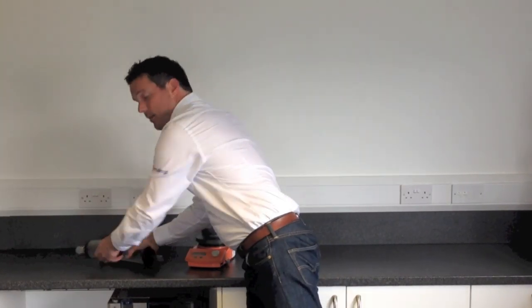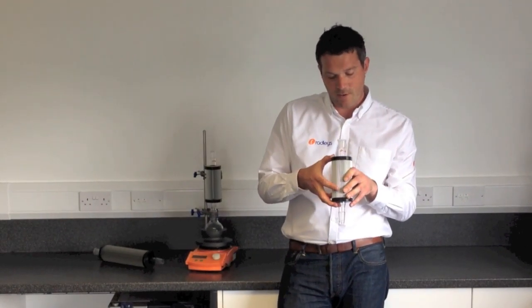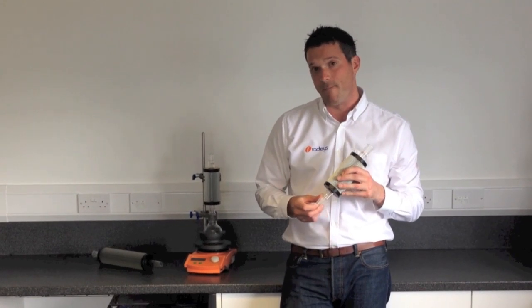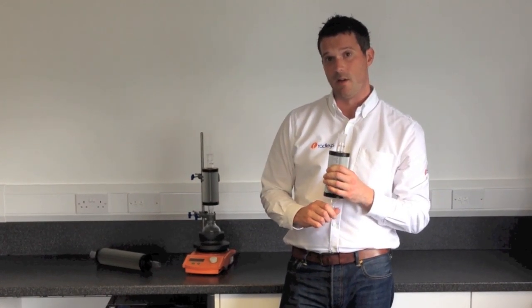And then we've got the Thindenser Mini. So this is much smaller. It's 275mm long and it comes in smaller joint sizes of B14, B19 and B24, and this one's good for up to 250ml flasks with about 100ml of solvent in.